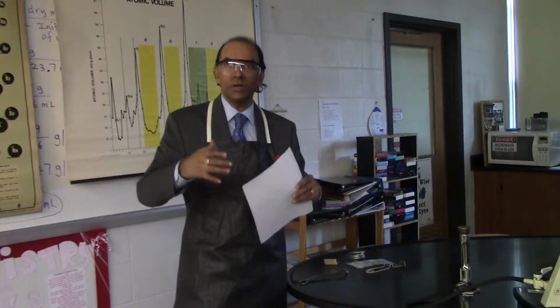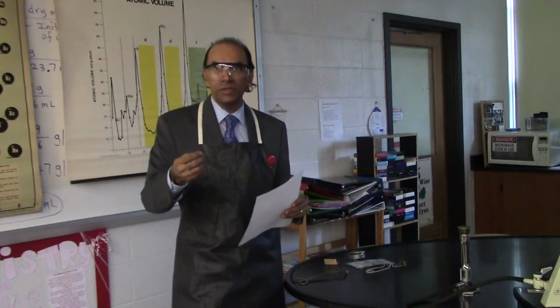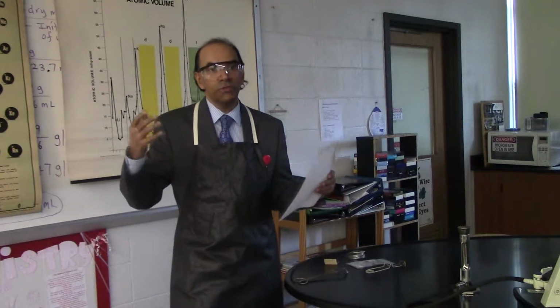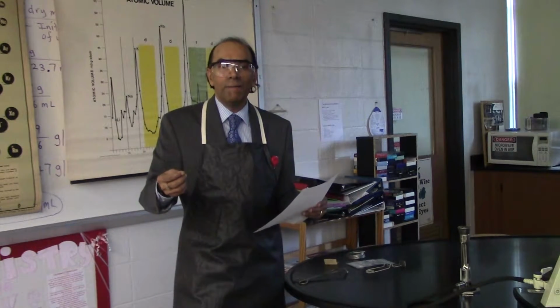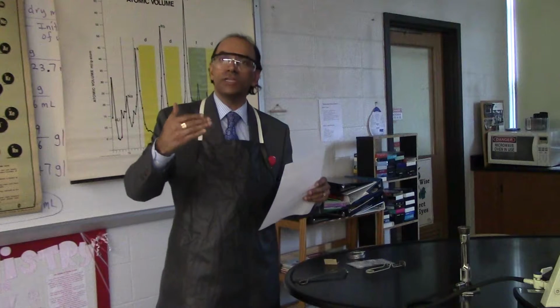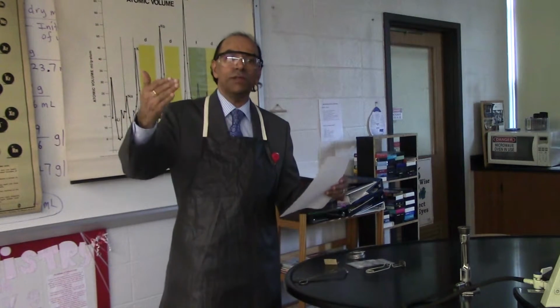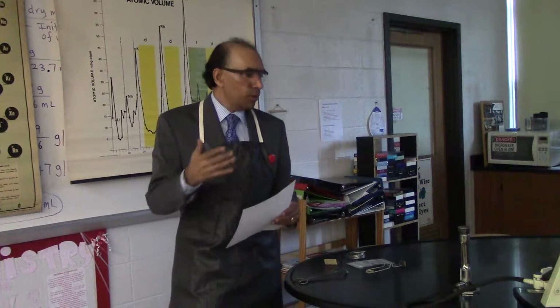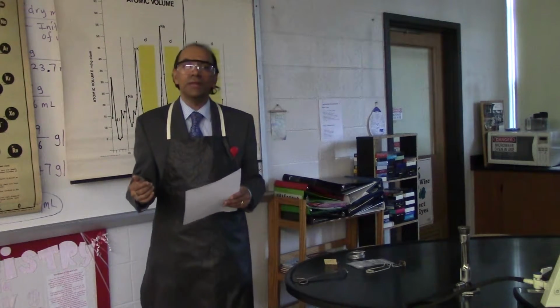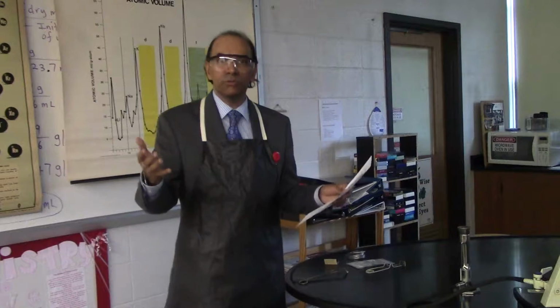Today's experiment has to do with light. So it's a natural phenomenon you can talk about. You can show a video on light. You can turn on a light in your classroom. And you can talk about how electrons get really excited, and when they fall back to their ground states in the atoms, they actually produce light. So I want to do a simple experiment today, and this experiment has to do with burning magnesium ribbon.